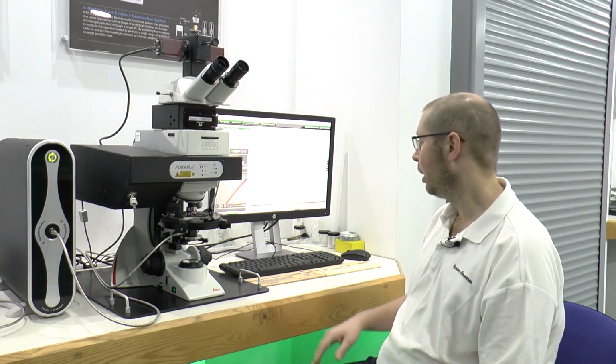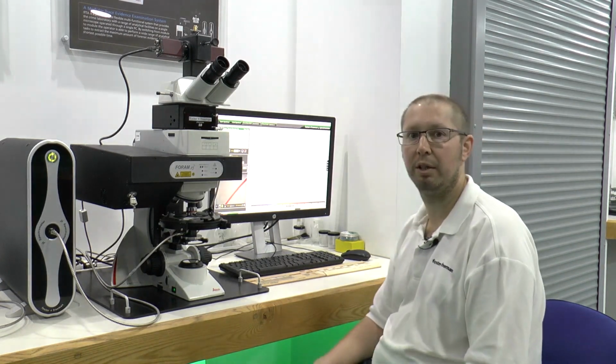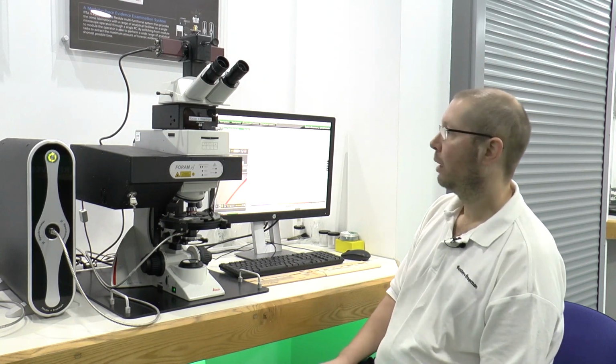We have a number of samples here submitted to the laboratory from the crime scene examination. We have some suspected hairs and some textile fibres that have been recovered from the crime scene.